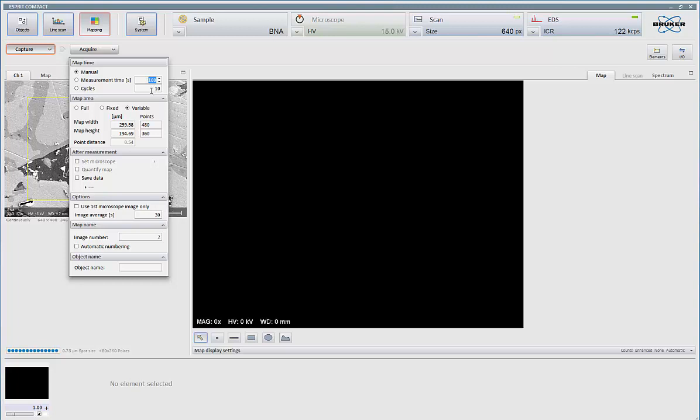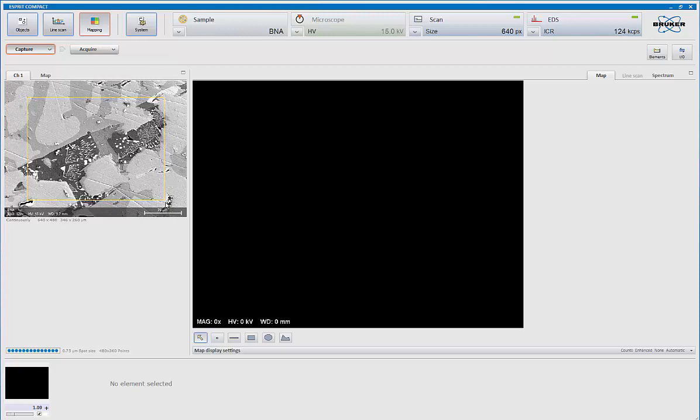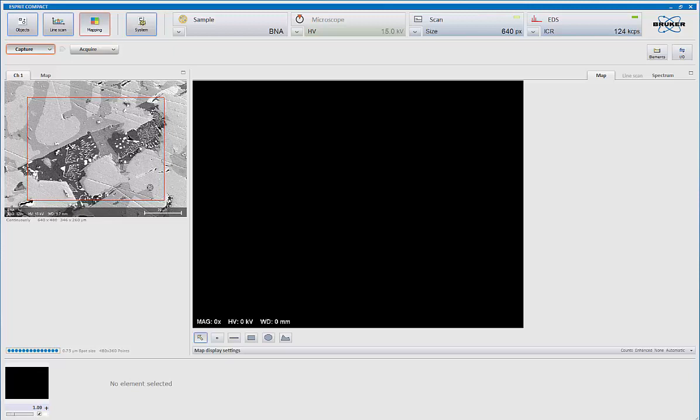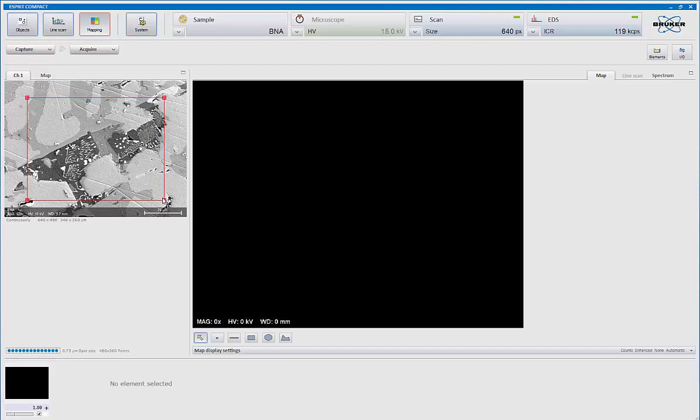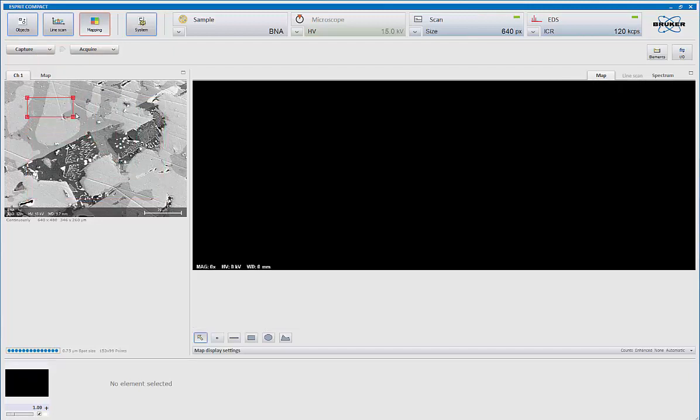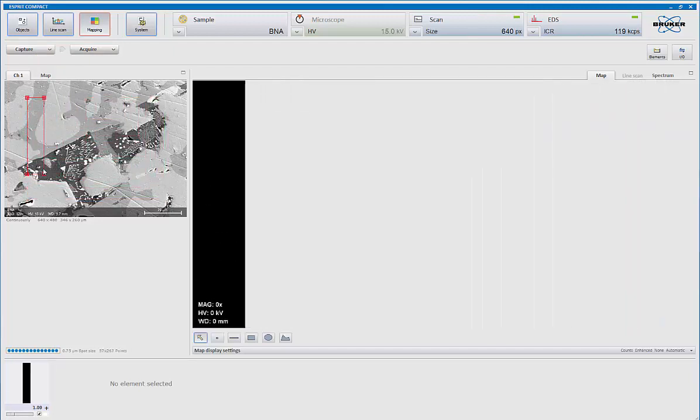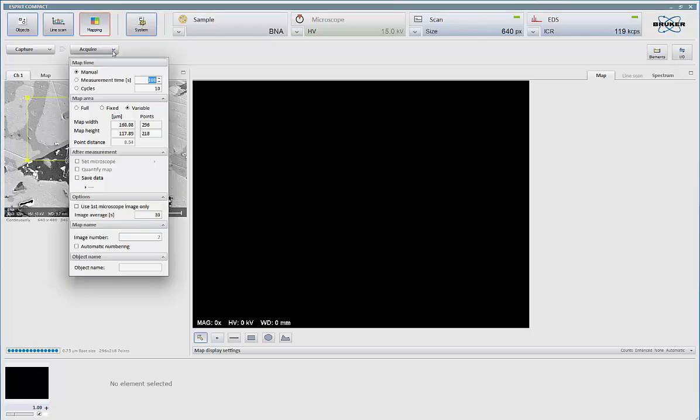I can also elect to do a subset of the collected image, which we call the variable field, and in doing that, I simply click on the box that'll highlight it in red, and then I can pick up a corner and adjust the frame. Let me stop the acquisition. I can choose to elect a subset of this entire image, or in this case, I'm going to do the entire frame, so I'm going to set it to full.